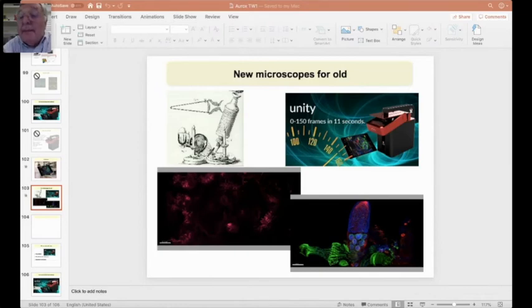Okay, I have a sort of question. I remember when I first came to this field, OBIC was still going strong, and it was regarded as a sort of future of scanning optical microscopy. What became of OBIC?